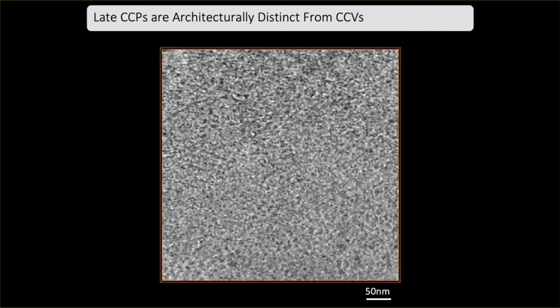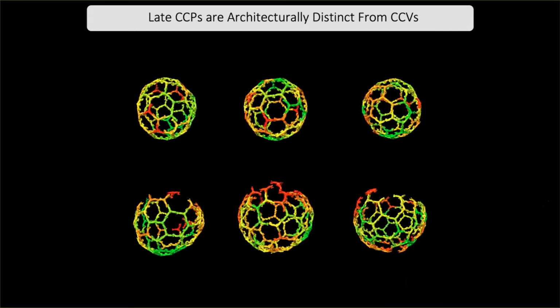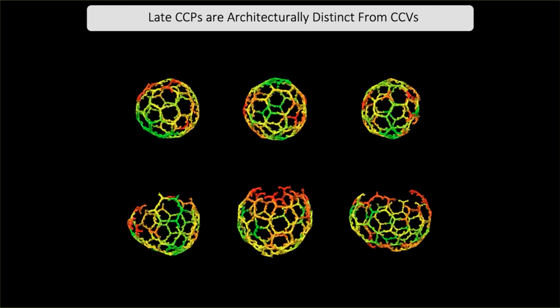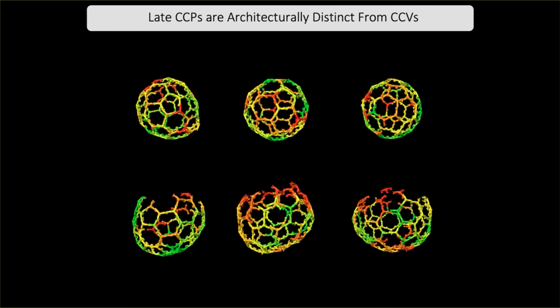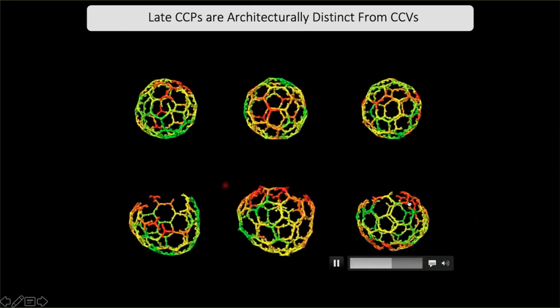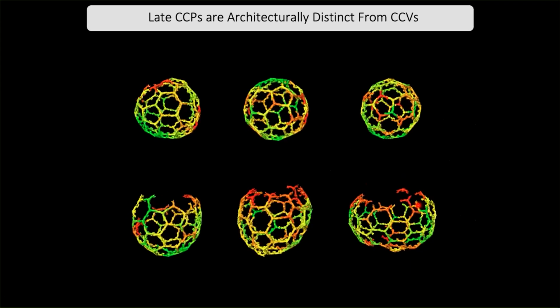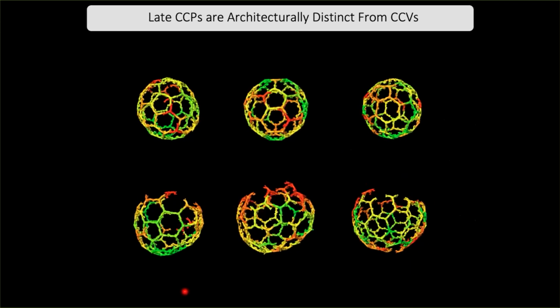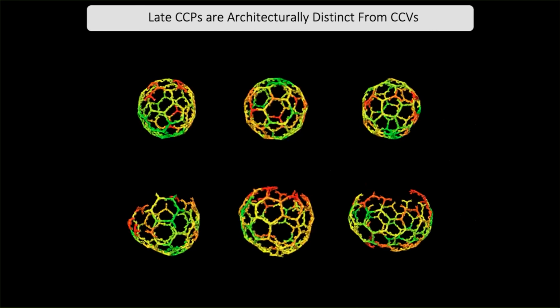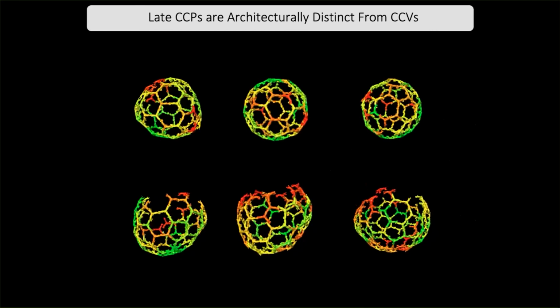And that can be used for further averaging, but it can also be used just to deduce the different architectures of the coat. So I would point out with this, just so it's not completely left hanging, that at the beginning I asked, how can we know that the object is maturing from something flat to something more curved?